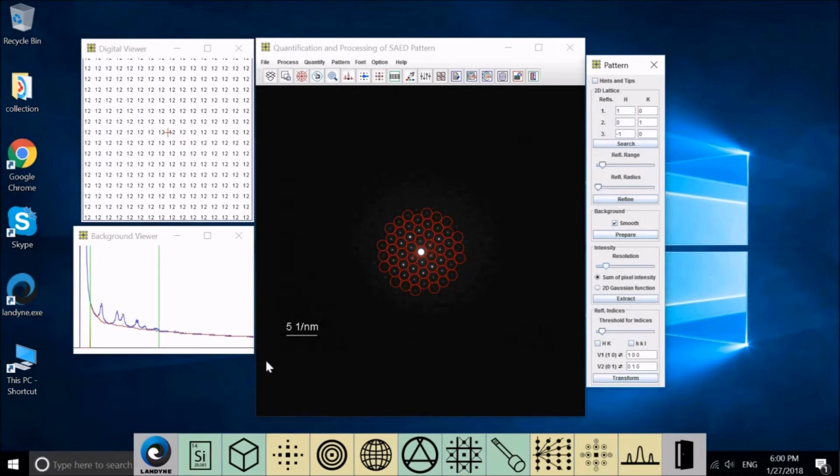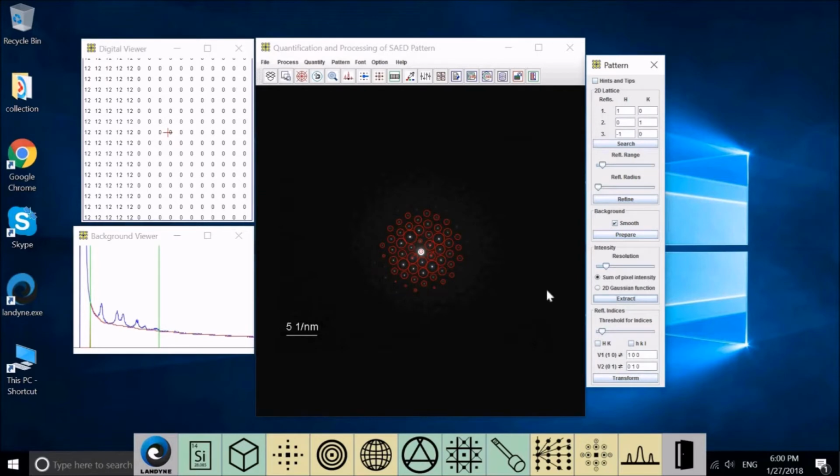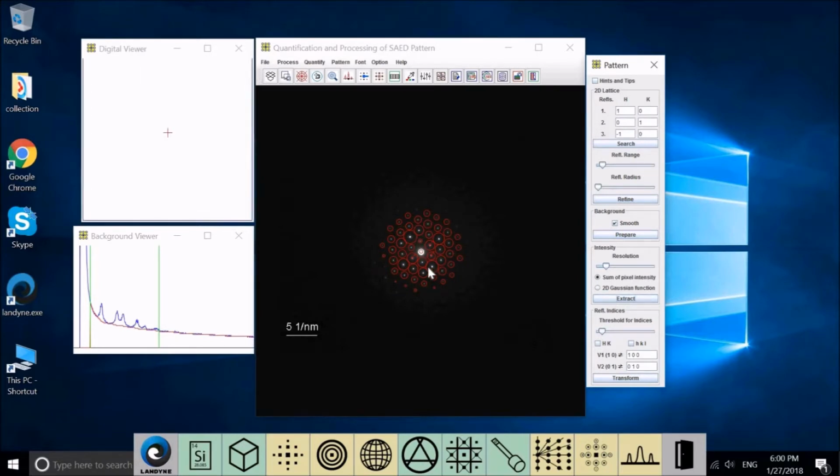The background intensity is removed from the same curve in both cases. Diffraction intensity is retrieved for display and can also be saved to an HKL intensity file.